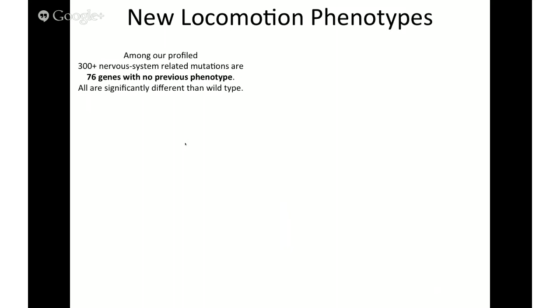I try to keep it at a pace where people can understand it. So hopefully I've convinced you that we have the sensitivity we need to notice the subtle differences between mutated worms and the controls. And what do we actually use it for? Well, it turns out that 86% of the worm genome has already been explored to some extent in screens, right? They use a technique in which they can interfere with individual genes using RNA interference, which I won't go into. And they did a large-scale screen, and unfortunately, even when you do this, you don't notice much of an effect.